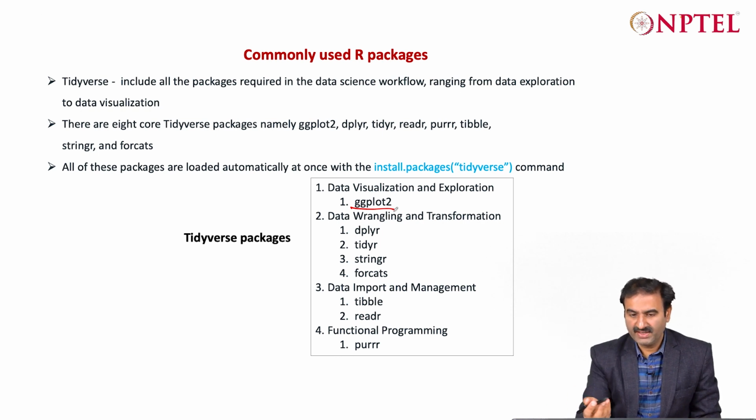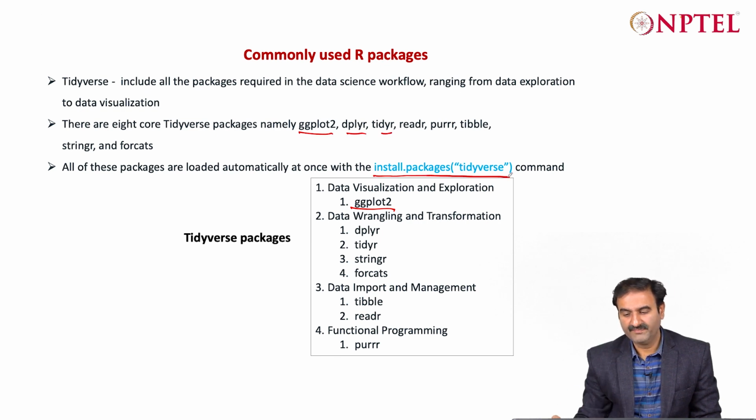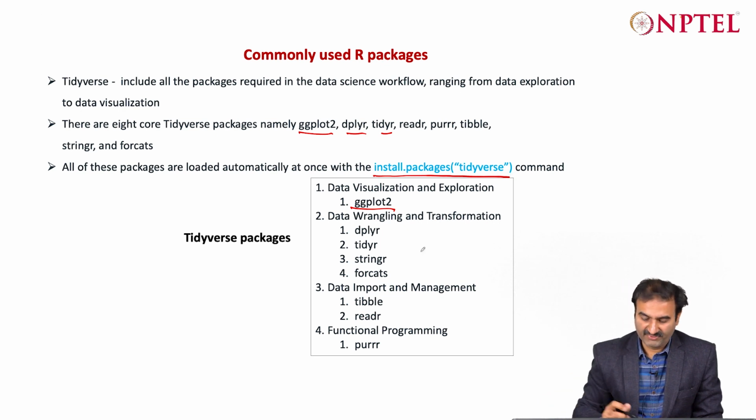Okay, so again, to install, you can install each of these separately, or you can just say install.packages tidyverse, so it will get all these packages together and install them.